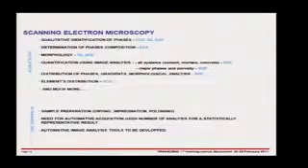So, the summary about scanning electron microscopy. The big advantage is you can qualitatively identify the phases. You can do this in several ways. You can do this by their morphology in secondary electron. You can do this by their gray level in backscattered electron. And you can do this by the chemical content by energy dispersive spectroscopy. You can more precisely determine the composition by energy dispersive spectroscopy. You can look at morphology by secondary electron, backscattered electron.